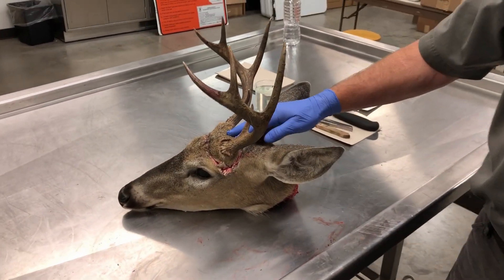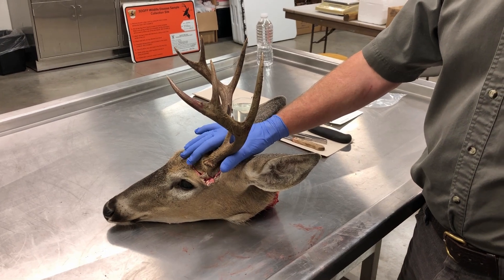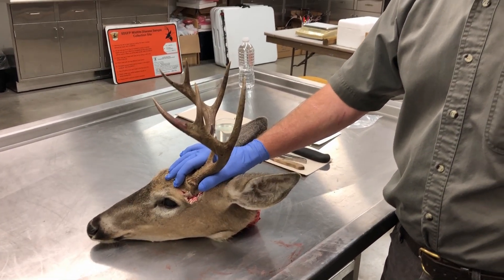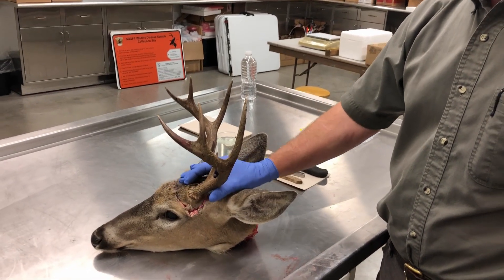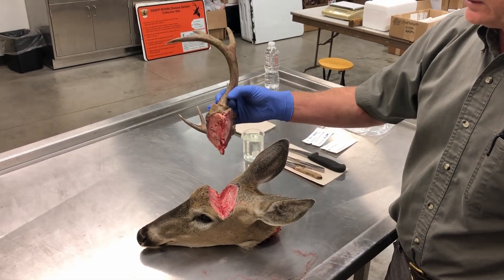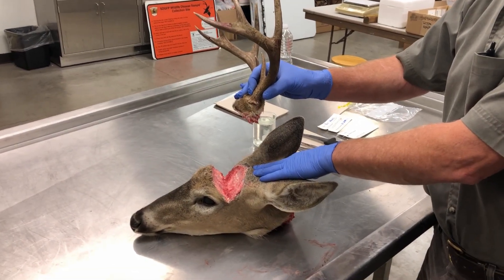So here's our subject right here, and we've done a little bit of prep on this. Sometimes you'll get a hunter harvest that'll come in and he'll want his antlers back or he'll want a European mount. So in this case, we have already V-cut these antlers off. As you'll see with this V-cut, this will come off. This will not affect your Chronic Wasting Disease sample.